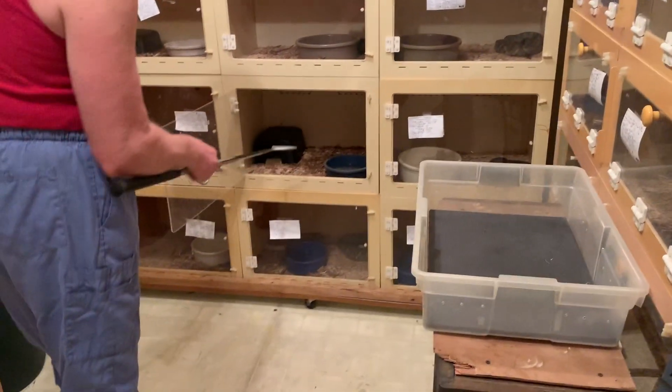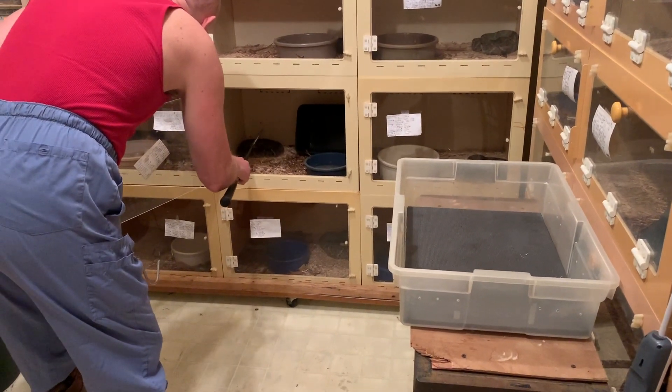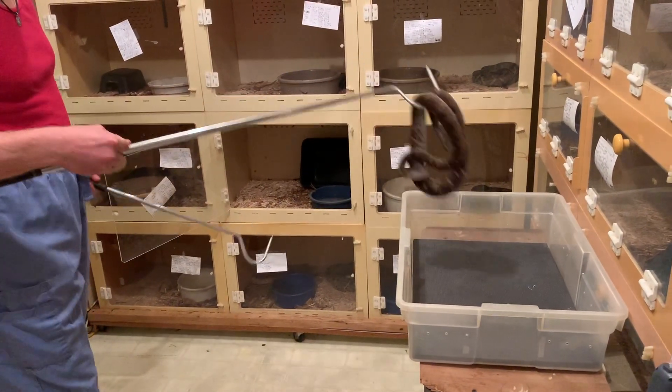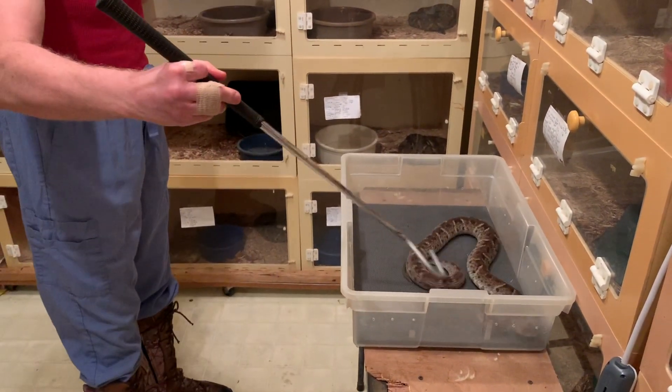Hello, this is Kristen at Kentucky Reptile Zoo. I'm here with Jim and we're extracting from Lancehead Vipers. These are common Lanceheads, both perhaps Bothrops atrox. This video will feature ones that are bloodlined from Suriname.